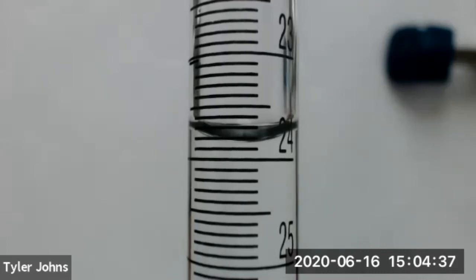Please empty your burette into your waste beaker and discard waste from your beakers and flasks into the waste container in the hood. So using our titrations, you should be able to determine the percent sodium hypochlorite in our commercial bleach solution. This concludes the volumetric analysis of bleach experiment.